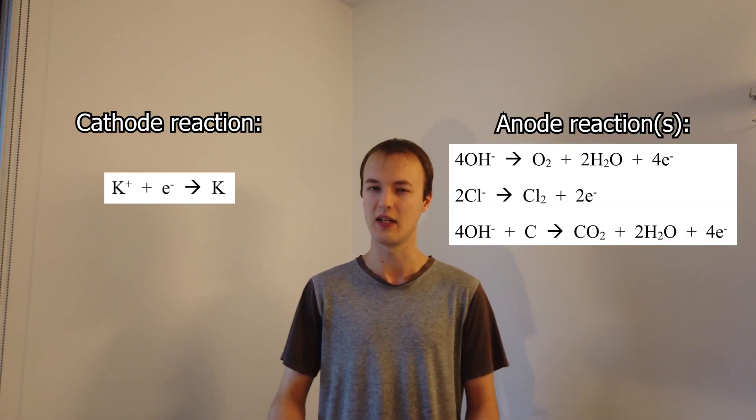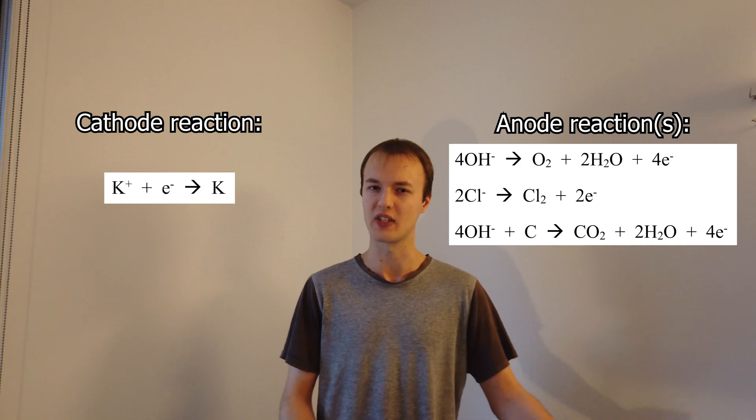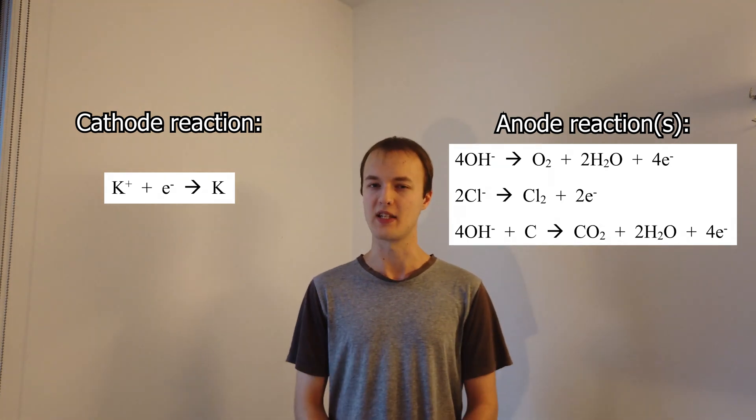I tried melting down the relevant mixture of potassium hydroxide, carbonate, and chloride. If it worked and we were able to electrolyse it, we expected the cathode — I used a nickel strip — to reduce potassium ions into potassium metal, which we could collect. The anode, which was a carbon rod, would oxidise hydroxide ions into water and oxygen, or chloride ions into chlorine, or maybe hydroxide ions and the carbon in the electrode into carbon dioxide and water — a whole mess of the three, possibly.